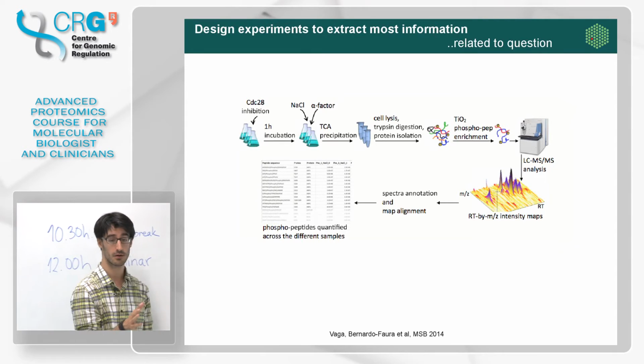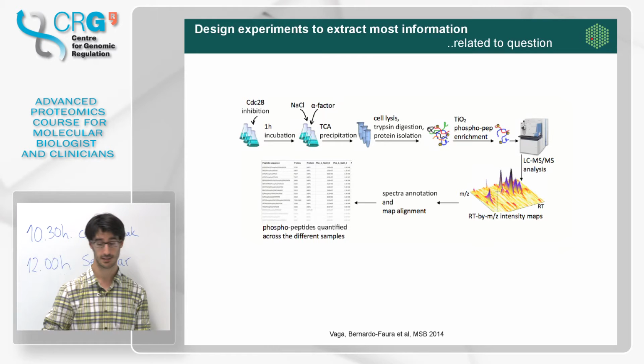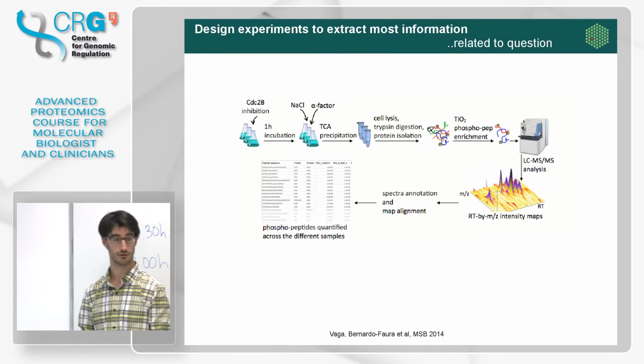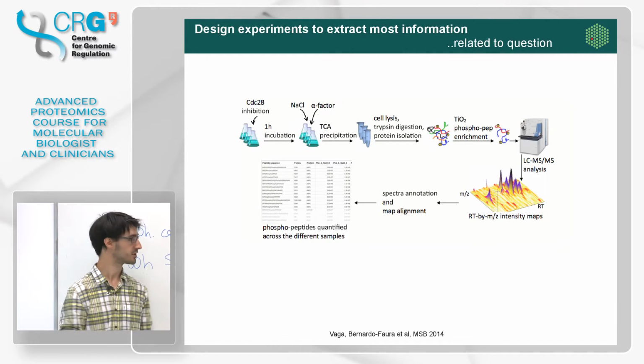By now you're experts in mass spec, way more than me. So I'm just not going to explain to you how the experiment was done. The samples were phospho-enriched, and it's a shotgun experiment. If you're more interested in the details, you can see it in the paper.